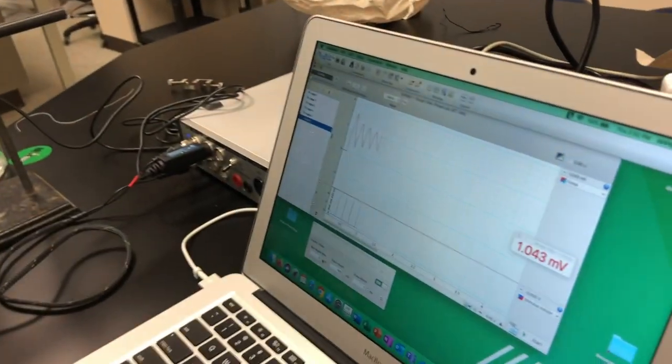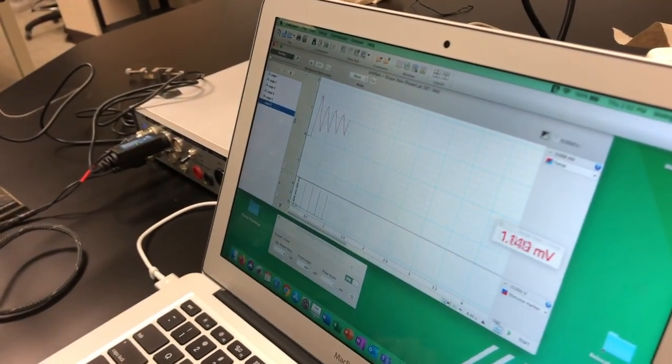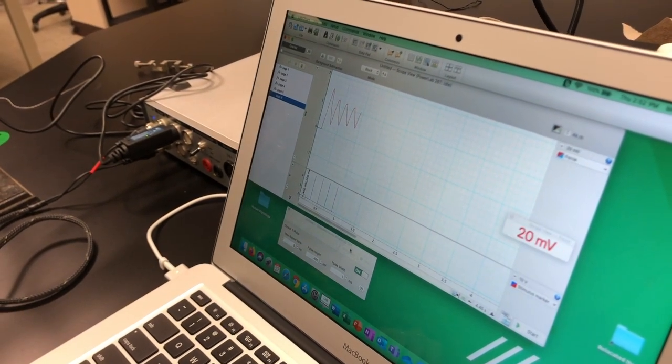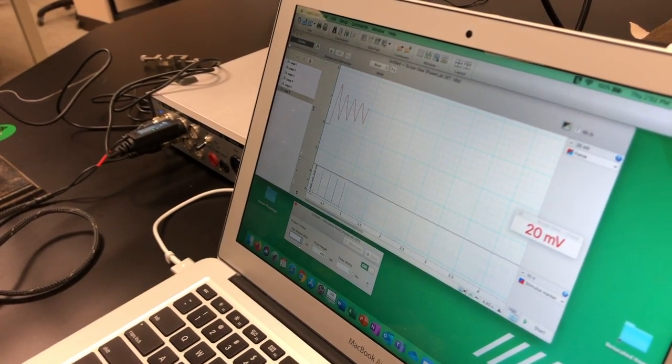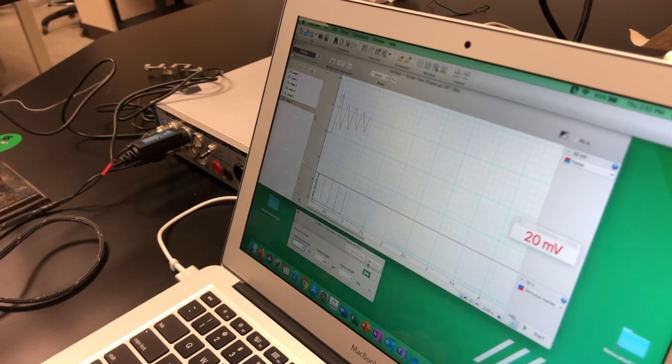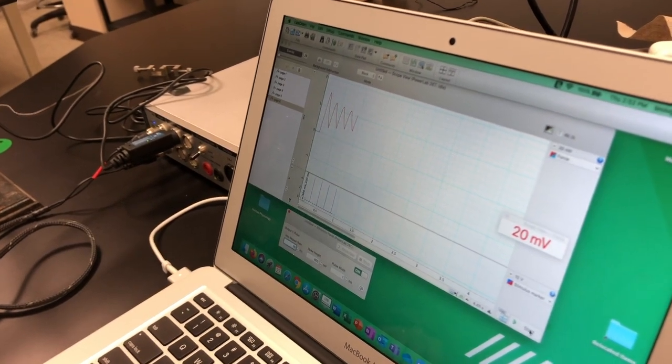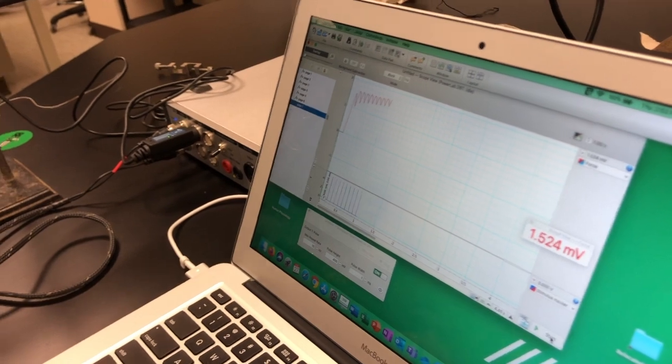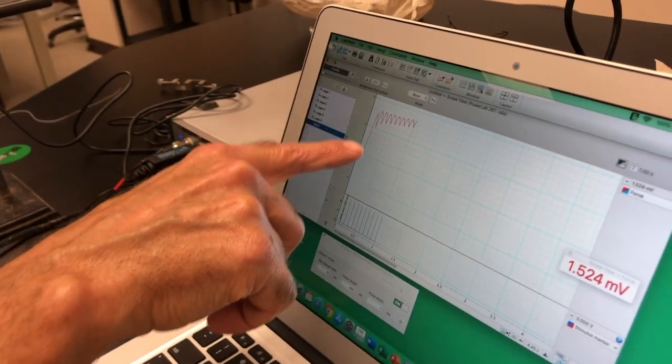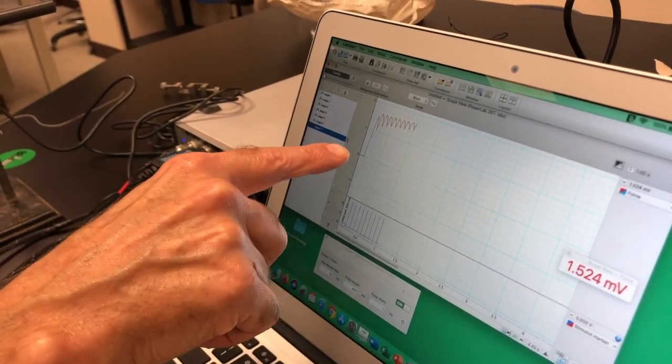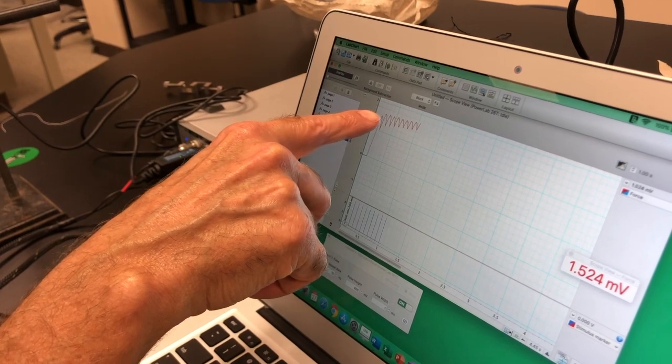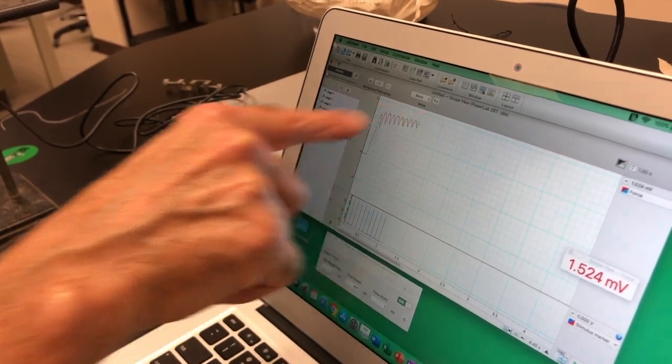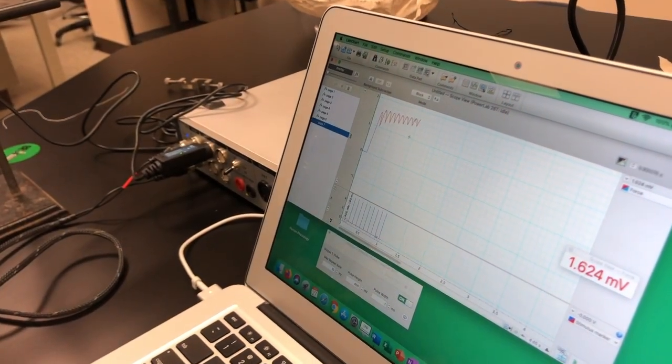And we should probably give it a little bit of time to recover and make sure we're moistening it. In other words, we're still about the 1.6 maximum for this. Let's go up to 10 hertz. And see what happens. And you can see that the muscle never comes back down to rest.